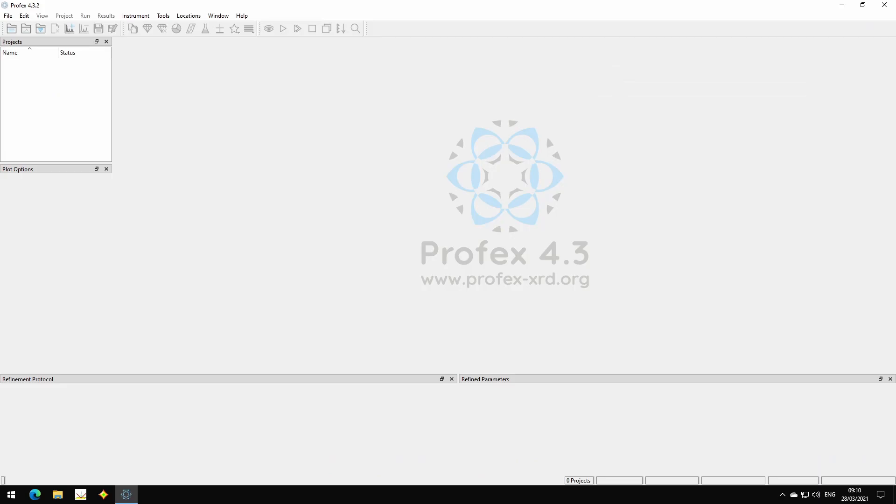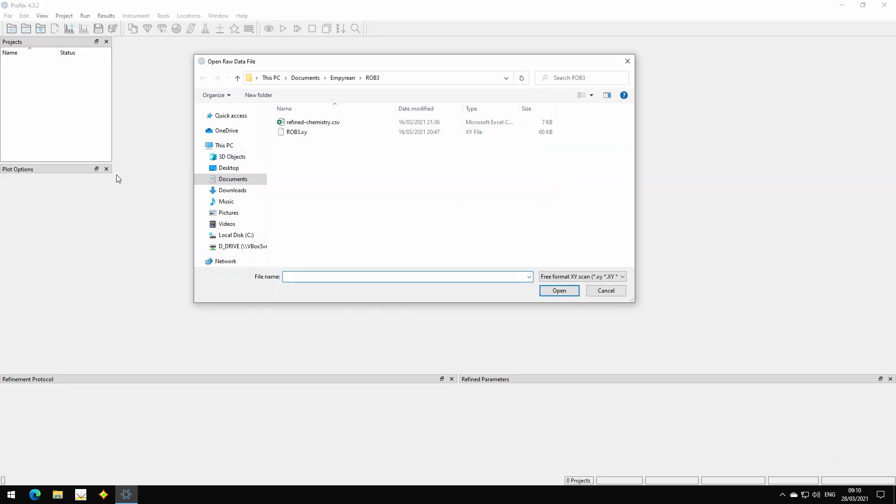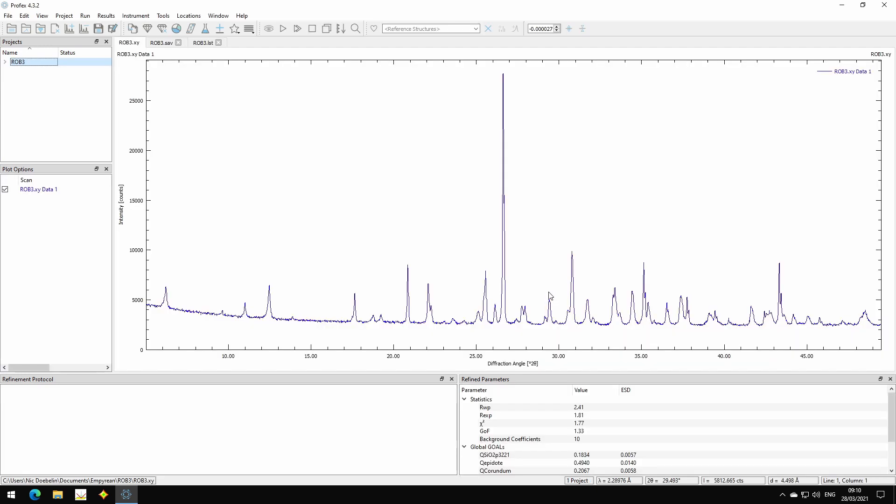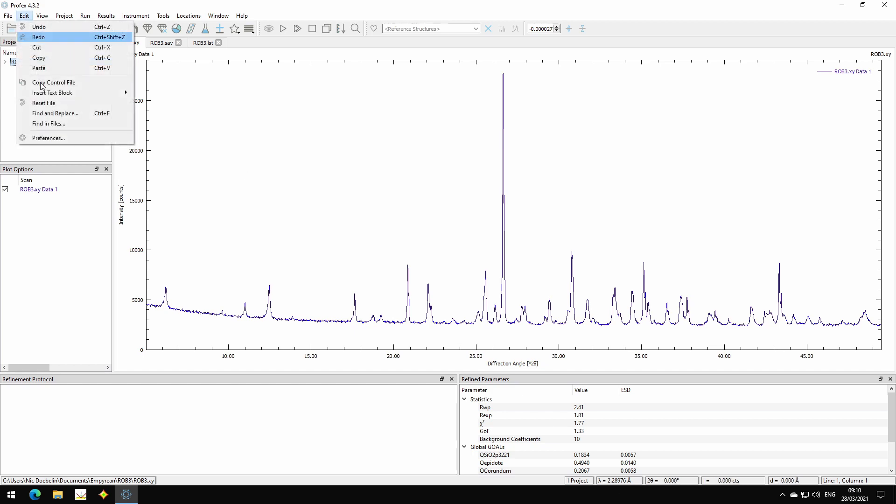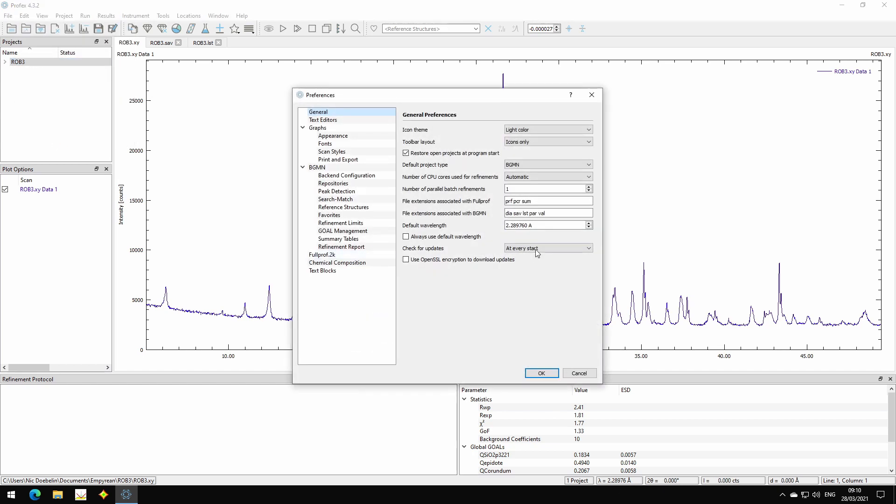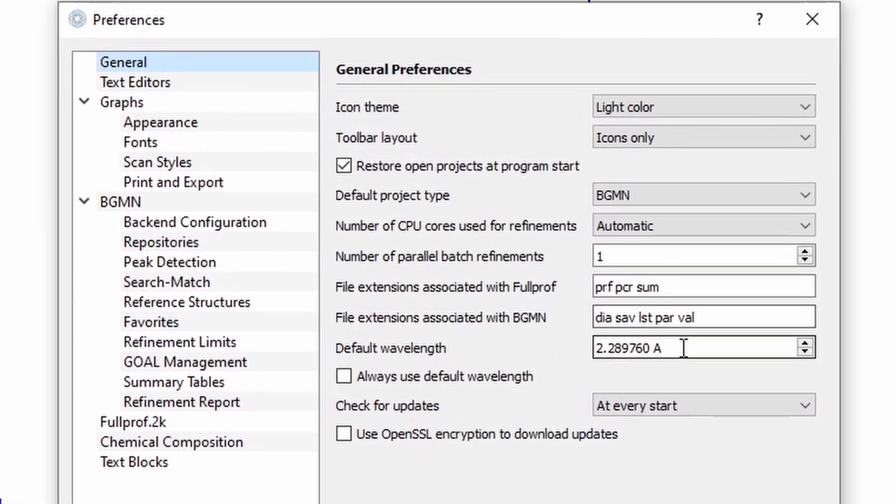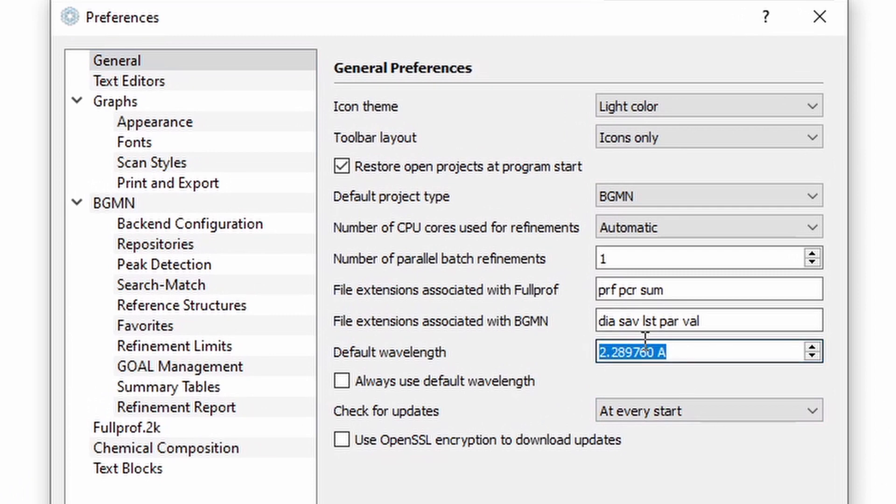Then when we open a scan file that does not contain any wavelength information, for example, an XY text file, Profex applies a wavelength that is configured in the Edit Preferences dialog. It's the default wavelength. In this case, it was set to chromium k-alpha-1.